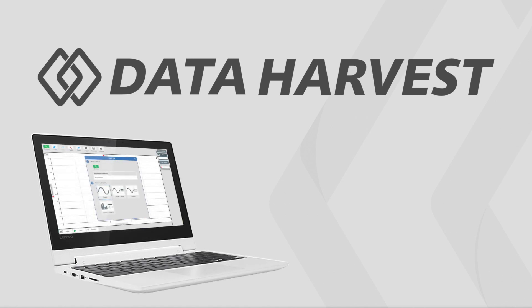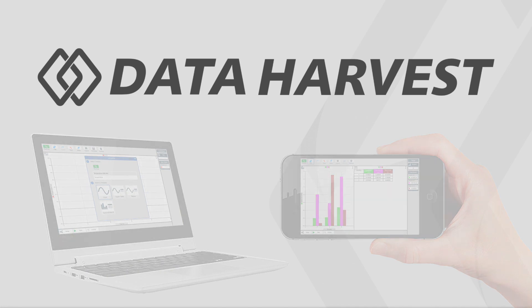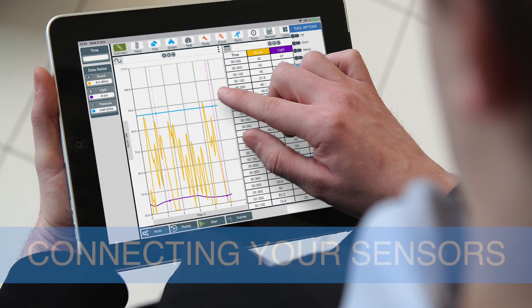In this video, we're going to walk through the EasySense 2 software and show you how to connect your smart wireless Bluetooth device using either USB or wirelessly via Bluetooth.